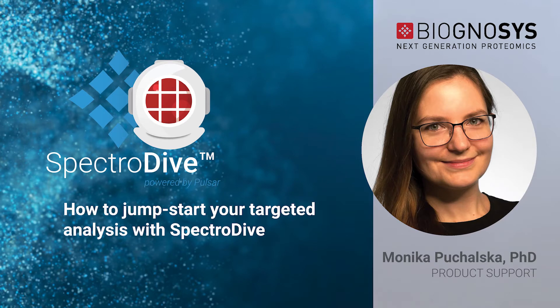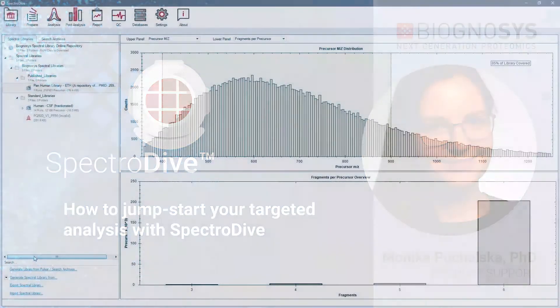Biognosys software solution for targeted proteomics, including PRM, MRM and through-quant workflows.